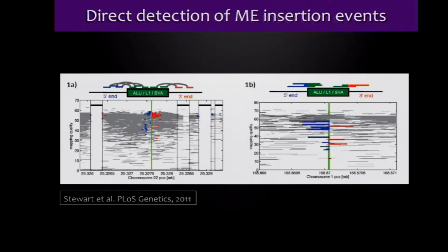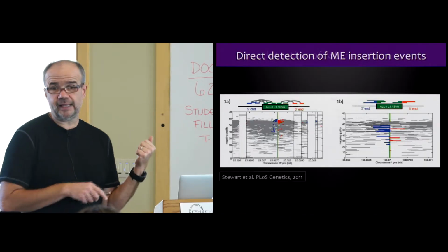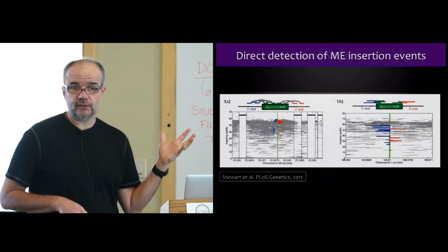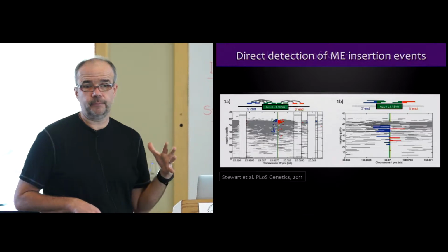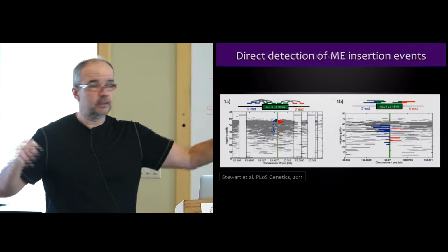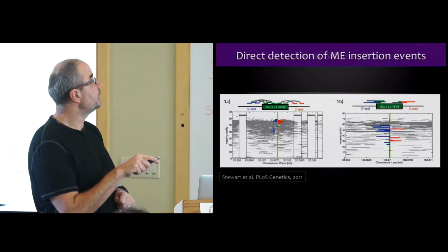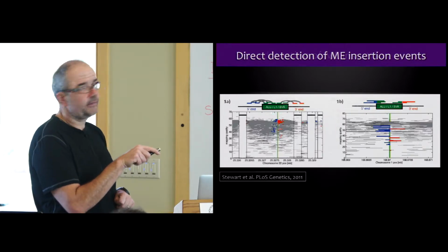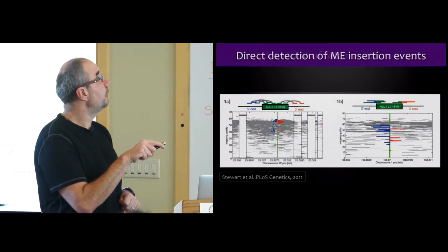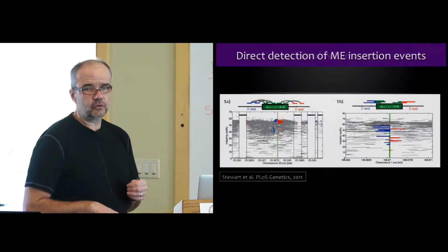This is not a trivial situation, because you see a lot of elements like this in the genome that are not polymorphic and not insertions in that sample, since the reference sequence already contains a ton of Alus. So it has to be done with care, to know that this particular element is really not present in the reference sequence. That's why it's unmapped, but it does map to the known sequence of the insertion element.